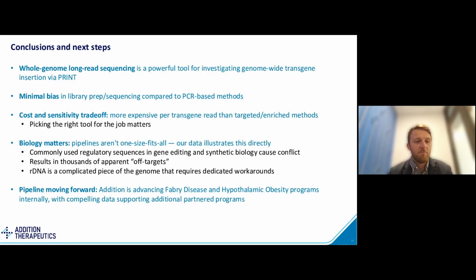Furthermore, biology matters, and biology matters to computational biology as well, which is something I think can get forgotten a lot. Pipelines aren't one size fits all. Commonly used regulatory sequences in gene editing and synthetic biology cause conflict, and that has to be accounted for. Otherwise, you get thousands of apparent off targets in your data.